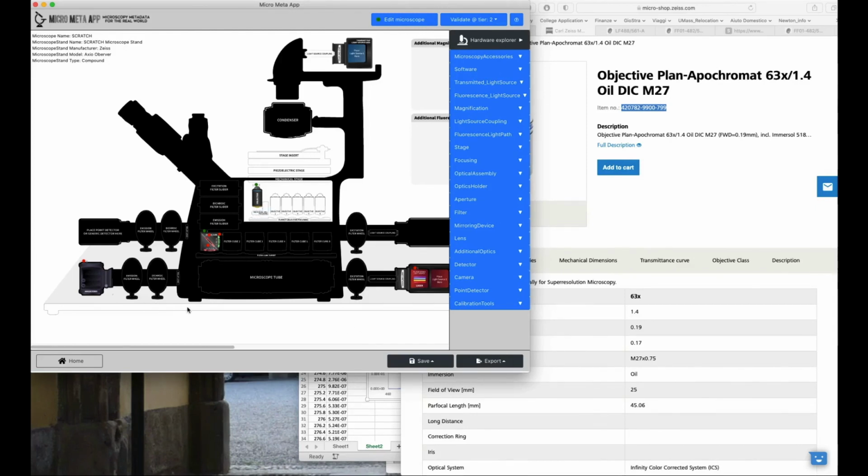So the same process can be repeated with other components so that missing information can be added to bring the validation level to Tier 2 or even higher levels in case it is needed for other types of experiments. So I recommend that you adopt this trick to get started slow with minimal information and then proceed by gradually adding more information as they become available or if they are needed.